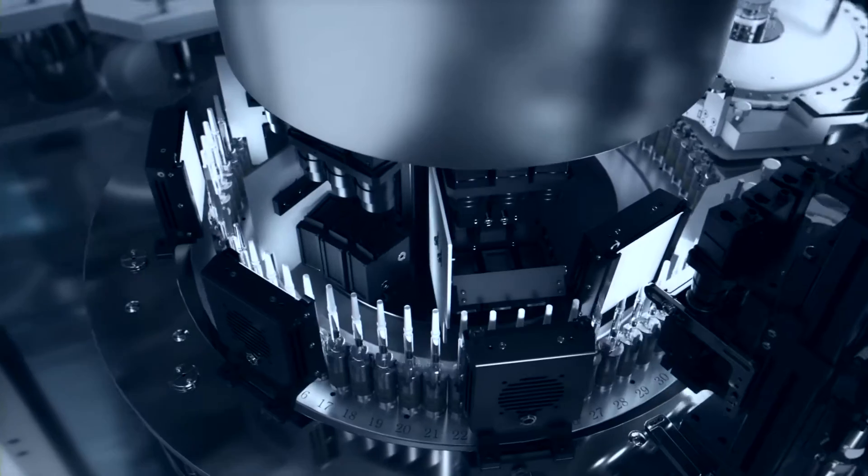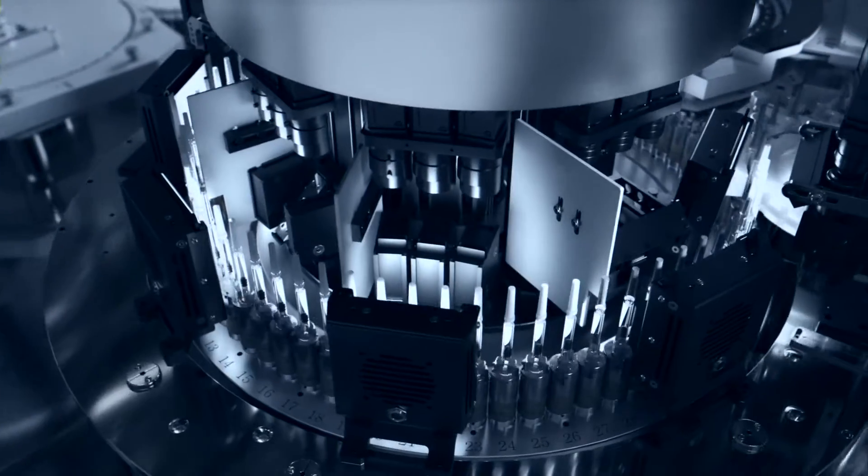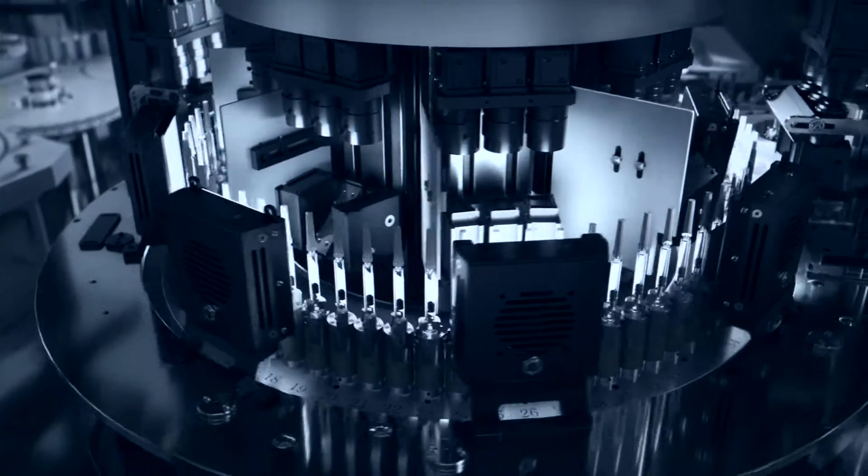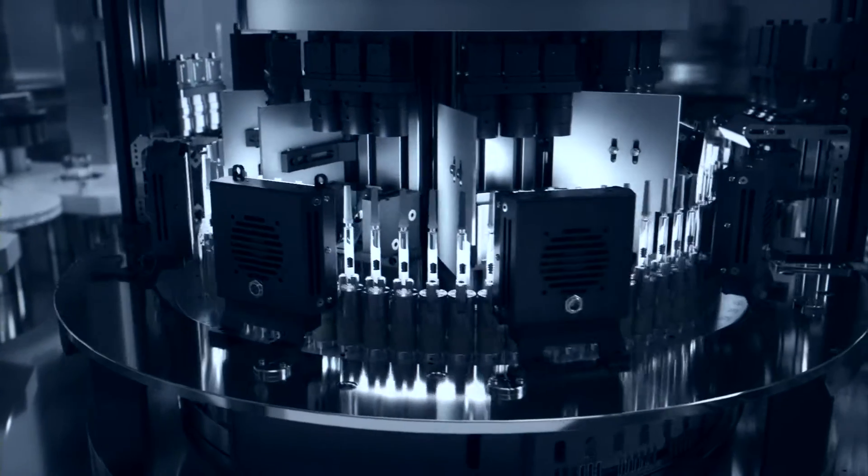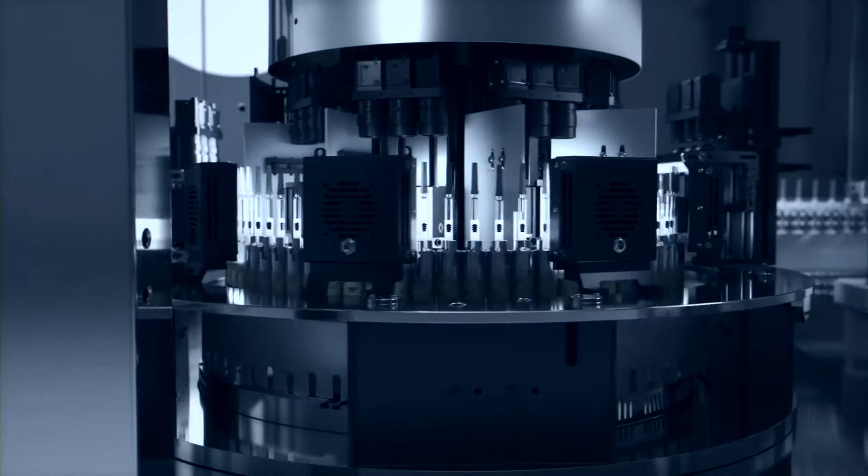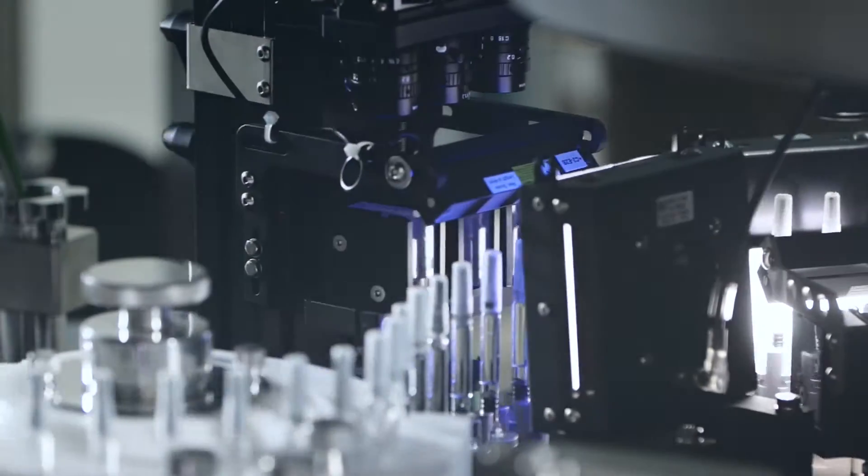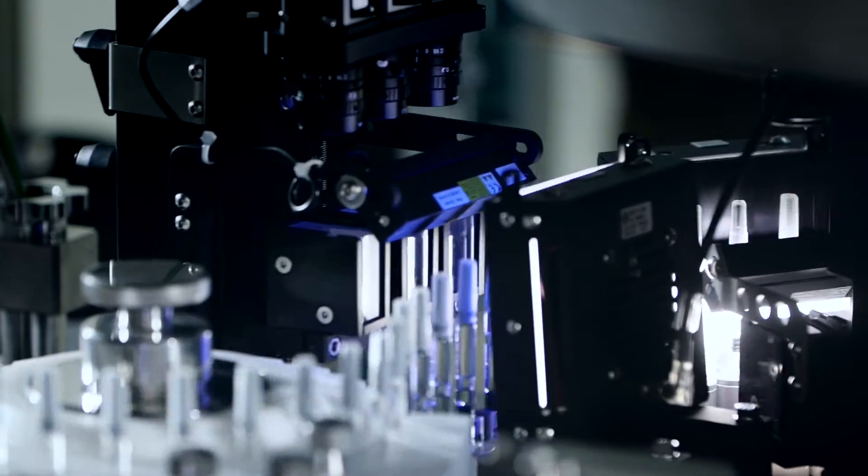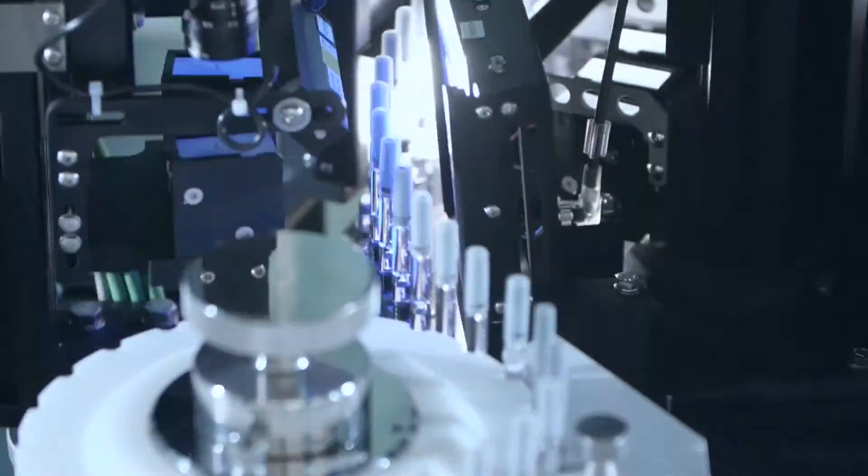But it is in the heart of the inspection module that Breveti K15DR assures outstanding results, thanks to its new framework, Breveti Intelligent Vision, an optimized integrated vision platform of consolidated and new technologies that takes performance to a completely new level.